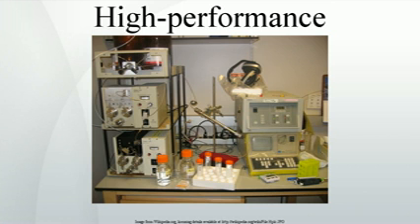Due to the small sample amount separated in analytical HPLC, typical column dimensions are 2.1 to 4.6 mm diameter, and 30 to 250 mm length. Also HPLC columns are made with smaller sorbent particles, 2 to 50 micrometer in average particle size. This gives HPLC superior resolving power when separating mixtures, which is why it is a popular chromatographic technique.